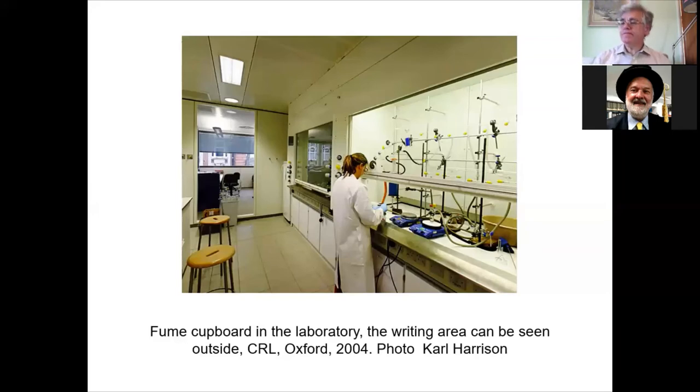You still have enormous mass spectrometers, enormous NMR machines, they are really enormous. And also automated X-ray crystallography in the basement. That still goes on, but the average NMR and mass spec work of an average organic researcher, can one have an average organic researcher? That's all done in a little room behind the laboratory.